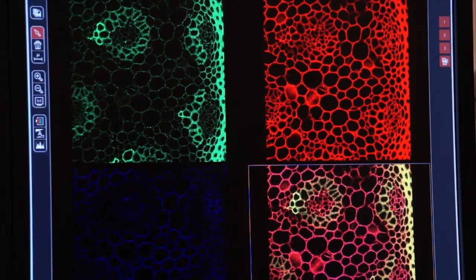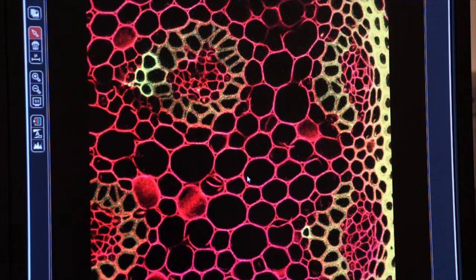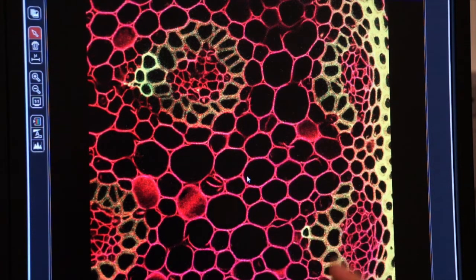It took a little longer that time. Why? Our resolution has doubled and now you can see it's a little bit better image but it's also becoming a little grainier. How do we eliminate some of that grain?